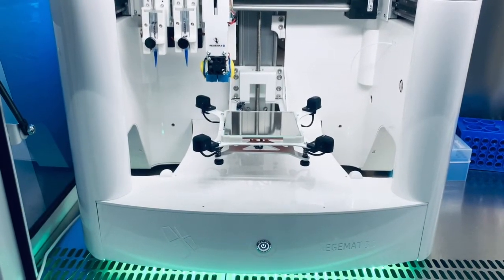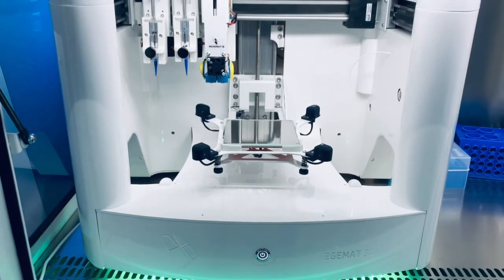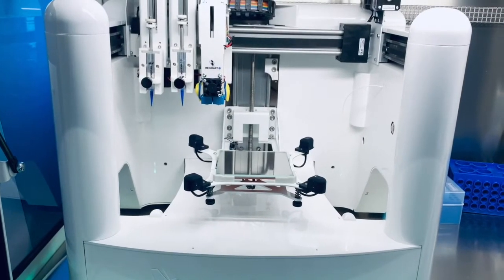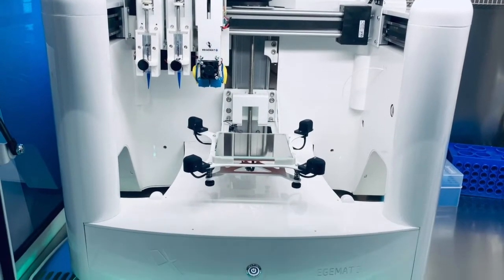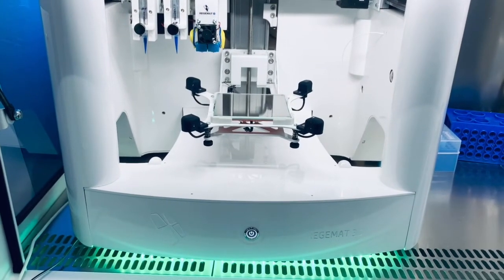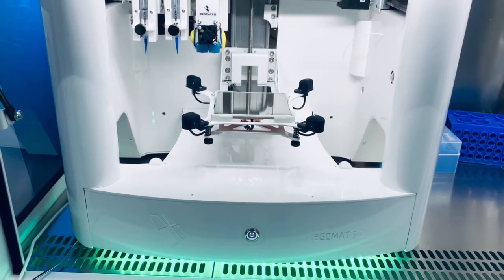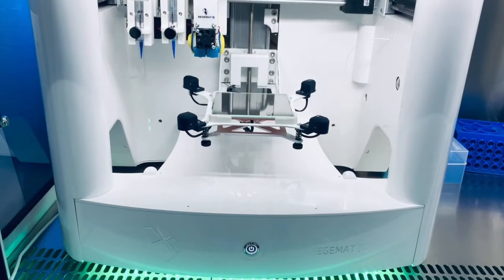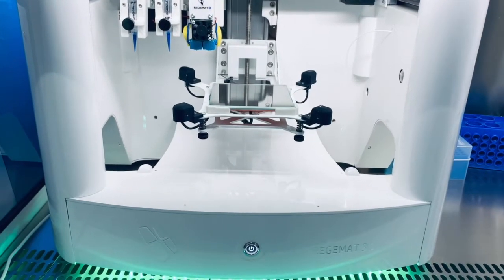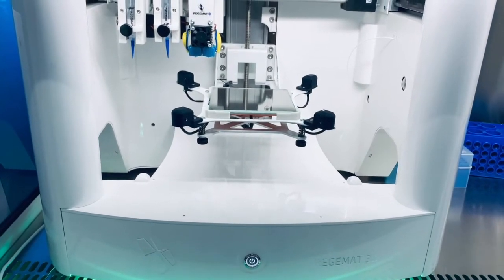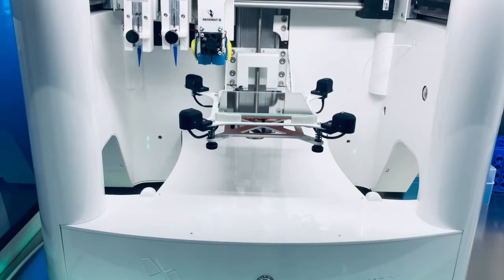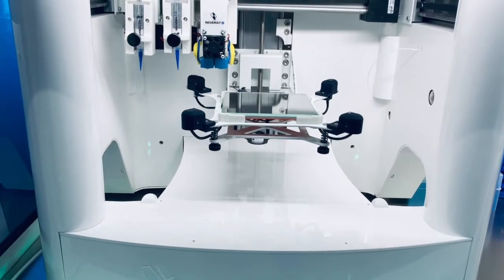More importantly, we have also developed a high-precision automated calibration for each of the bioprinting tools, which works with a laser system that places the nozzles at the desired locations in the z-axis, x-axis, and y-axis.